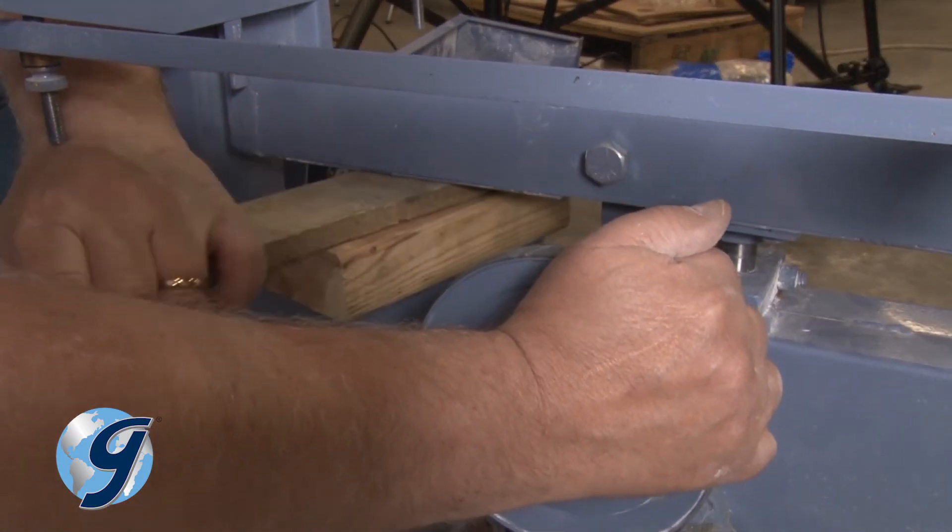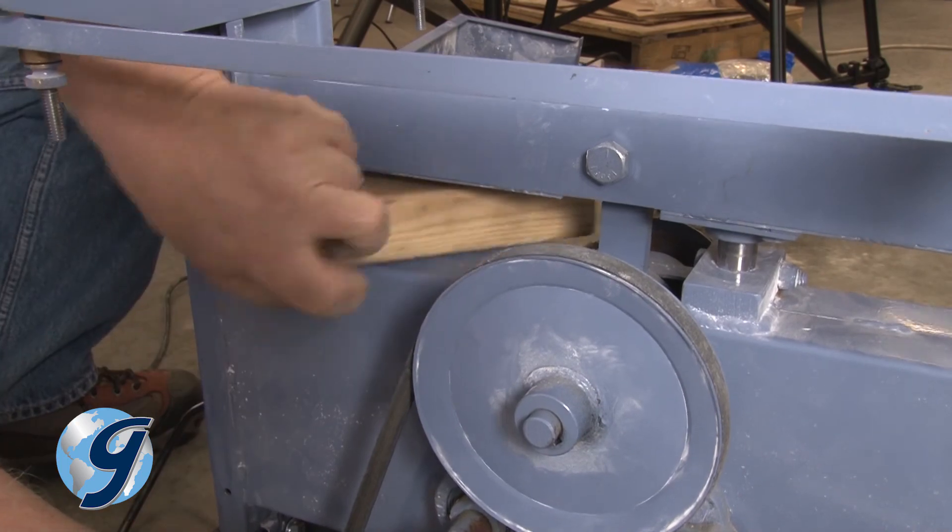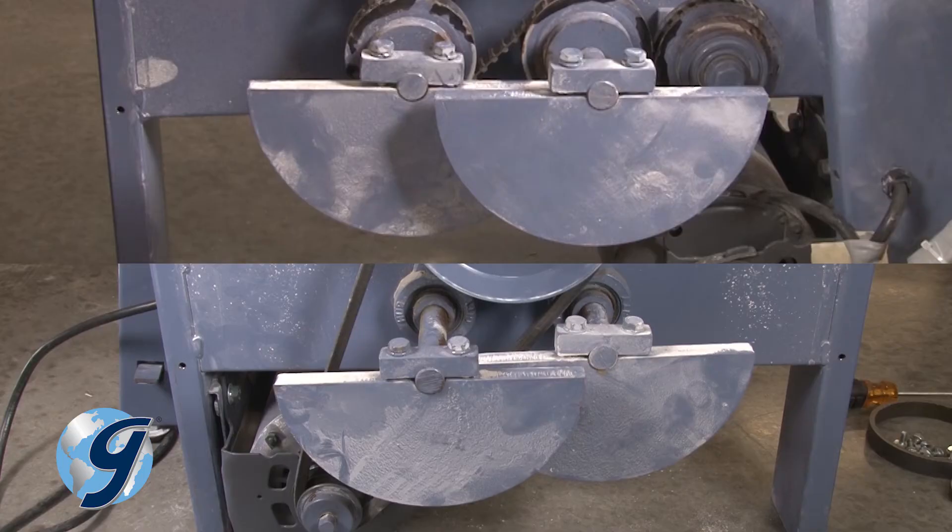Next, remove the wedging device. Now make sure that all four counterweights are at their lowest position, flat side equally up, while the connecting rod is at its highest position.